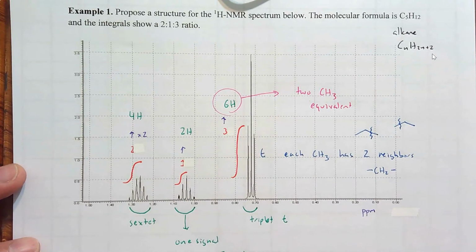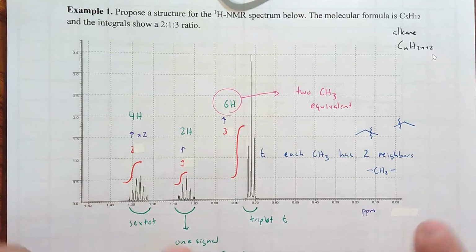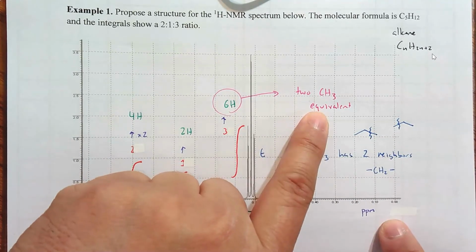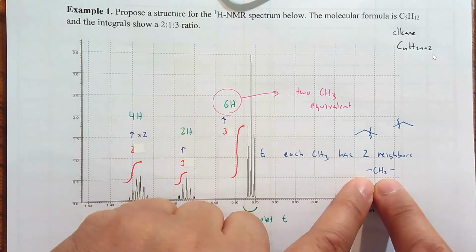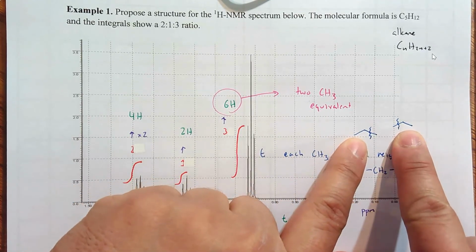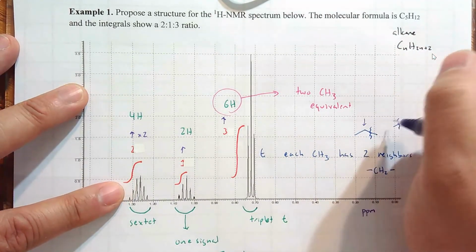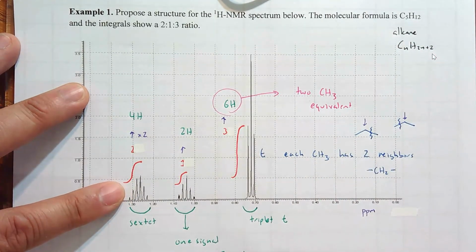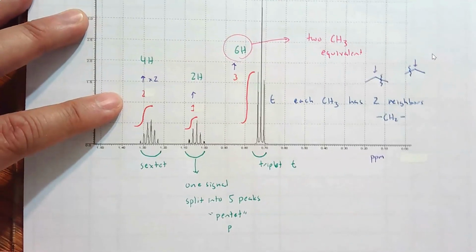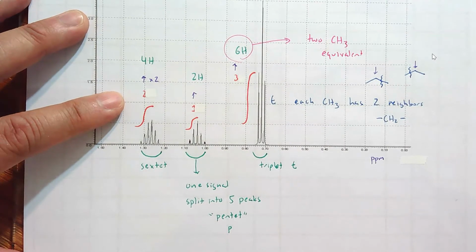Okay. Well, I have 4 carbons listed already. Oh, if it's true that these 2 methyls are equivalent, and they're both next to a CH2 group, maybe I have these 2 ethyl groups that are equivalent. That means that these 2 hydrogens are equivalent with these 2 hydrogens. And I bet that is the CH2 group that connects 2 parts.